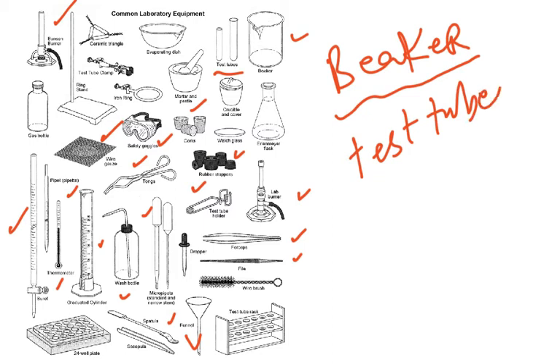So you must know what they look like and how we use them. And of course, we have a test tube rack as well in which we place the test tubes. So you must be familiar with these names, you must be familiar with the spellings, and you must be able to mention them in the practical procedures whenever we do those practical procedures.